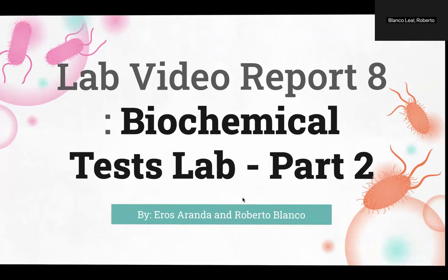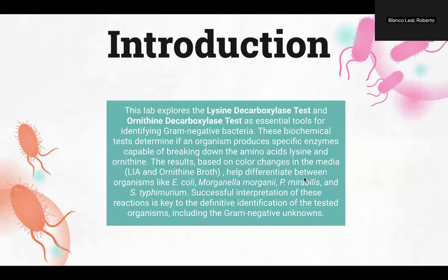Okay, Introduction. This lab explores the lysine decarboxylase test and the ornithine decarboxylase test. Basically, this is to identify gram-negative bacteria, depending on whether they are metabolizing. It's going to tell us through colors. It's a differential test, a selective test too. So it's going to tell us, hey, I want to let this bacteria grow, and if it does, it's going to change the color. These biochemical tests determine if an organism produces specific enzymes capable of breaking down the amino acids lysine or ornithine. Again, it's just going to specify if it's going to break it down.